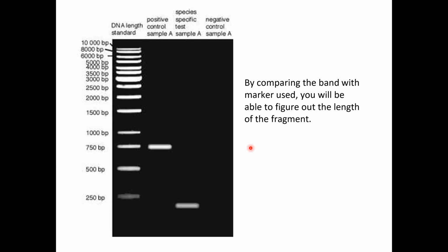But in the laboratory, I'm hopeful that your professor will help you to interpret properly, for example, how to interpret your agarose gel results. But this is just the concept for you. So you have to compare the band with the marker used and you'll be able to figure out the length of the fragment. So for example, this is the band you run.